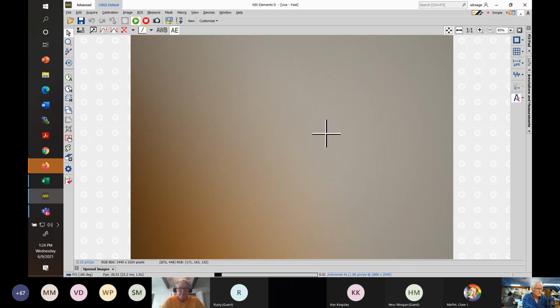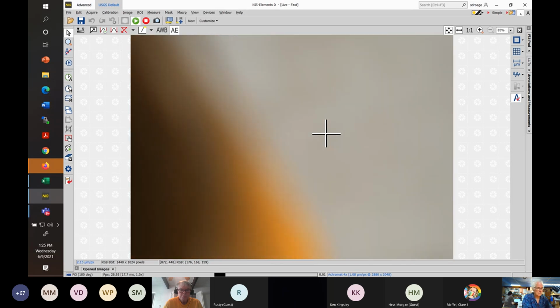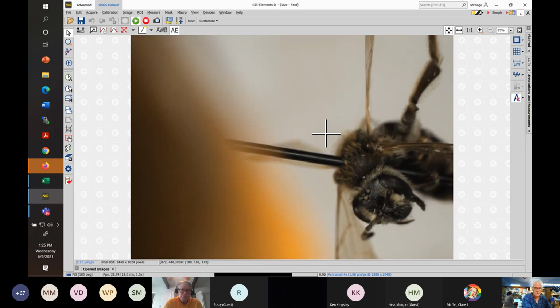I'm going to switch specimens now to get a slightly less hairy one, and we'll see if we can see the two subantennal suture line feature that Andrena has. It looks great in a book, let me just tell you that. It looks great in a book, and then trying to find it in a specimen is surprisingly difficult. So when we talk about subantennal sutures, let me zoom out and find a specimen here.